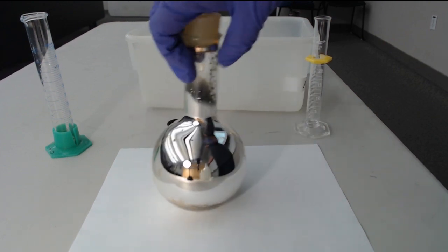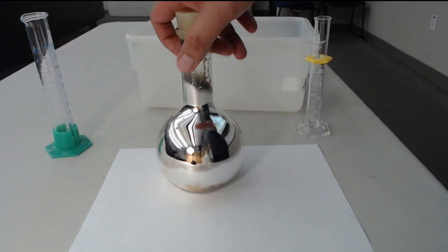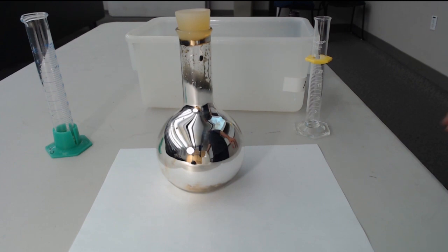People actually used to use a similar reaction like this. Some labs will do. Not so many anymore though. But you can do a similar reaction using copper as well. The thing about the copper reaction, you don't get the nice shiny silver there. You get basically a red brick precipitate. And what people would use that for is testing for sugars in urine. Can you guys think of the significance of that? Like is it good or bad if you have sugar in your urine? It's bad. And why is it bad? What is that indicator of? It's actually an indication of diabetes.